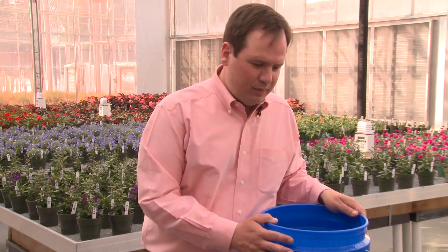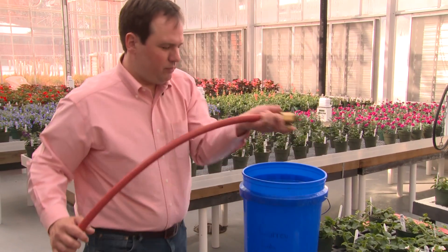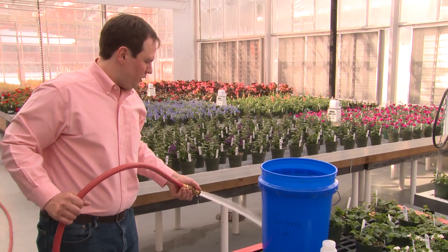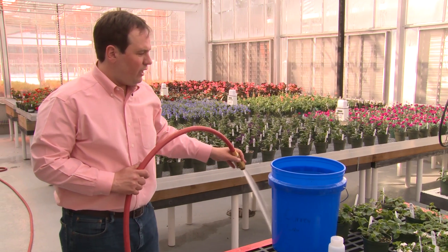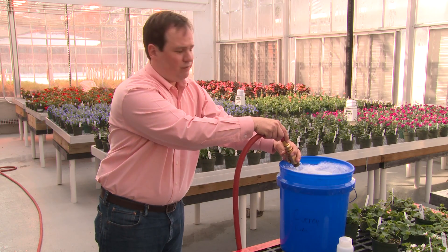We're going to cover three different methods for measuring our alkalinity levels in our irrigation water. First, we want to collect a sample of our irrigation water. We want to make sure that we have a representative sample. What I like to do is get my hose, turn it on, let it run a little bit, and then collect the sample in a bucket. I've already filled this five gallon bucket.